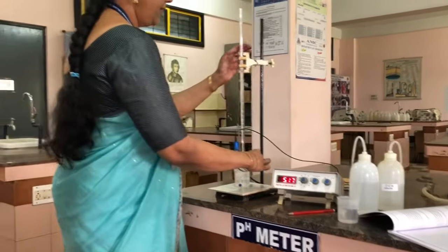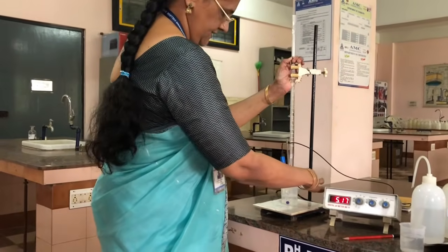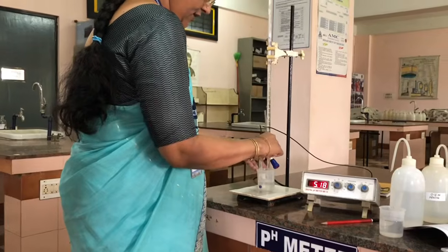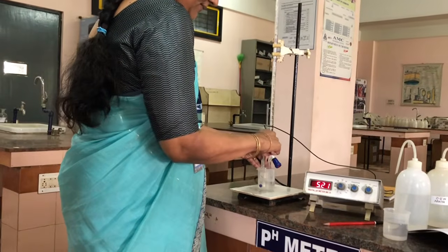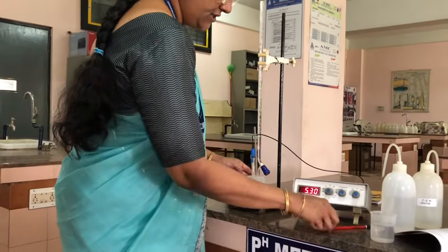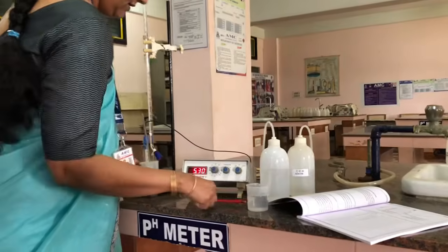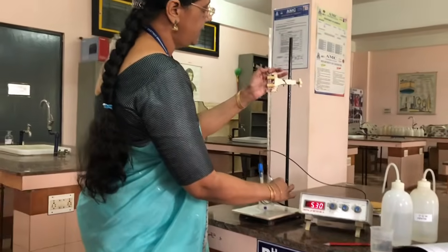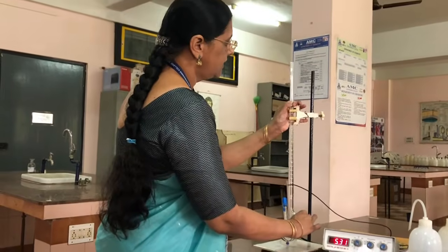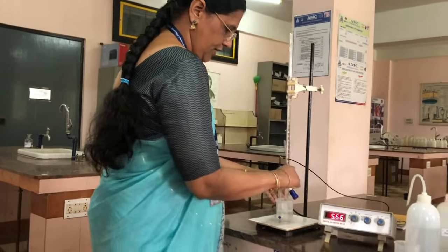Again you have to add 0.5 ml of sodium hydroxide from the burette. Again you have to shake the solution and note down, now it is 5.30. Now again we have to add 0.5 ml, shake the solution and note down.